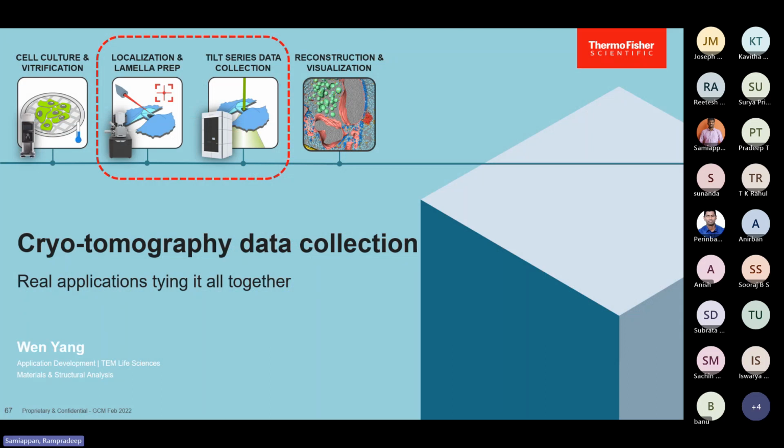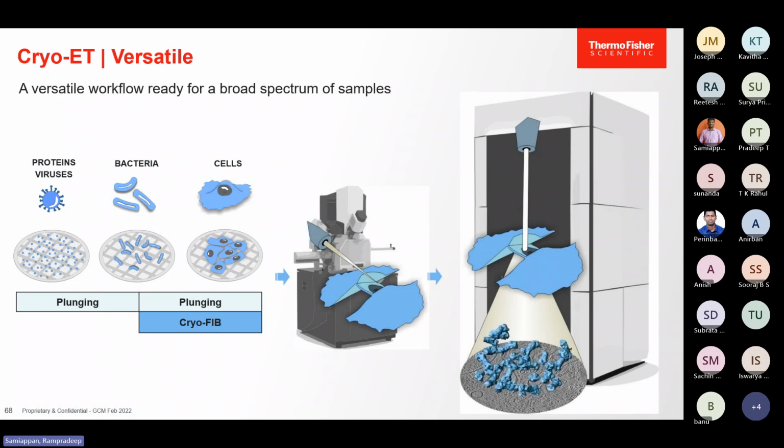As a whole, I would like to summarize. Irrespective of single particle analysis, cryo-tomography, or even if you take microED, the main important point behind it is how we are trying to answer a biological question of interest, how we are working on the purification protocol, and once the samples are optimized, which method we are trying to use, and what our ultimate objective is. That should be clear.